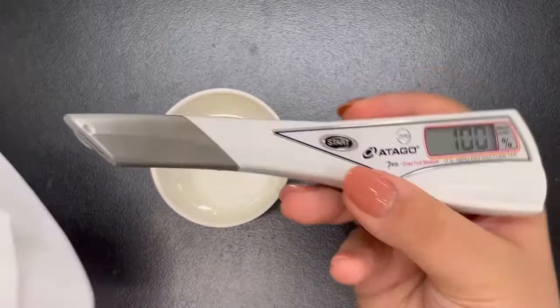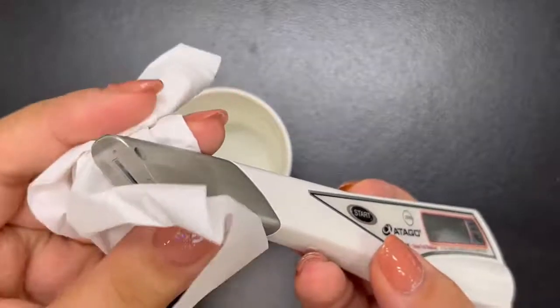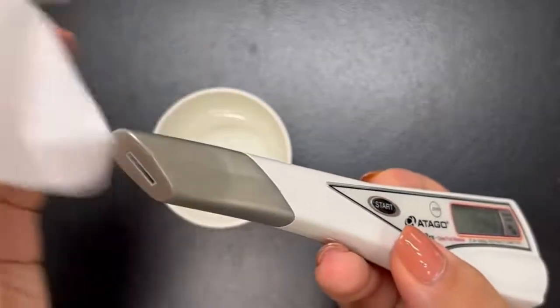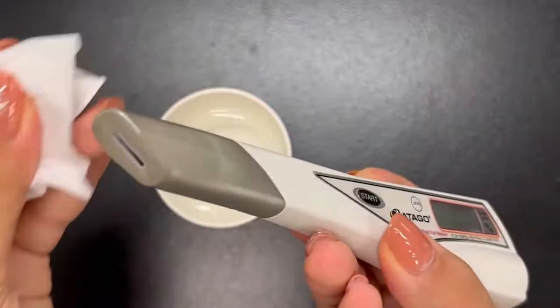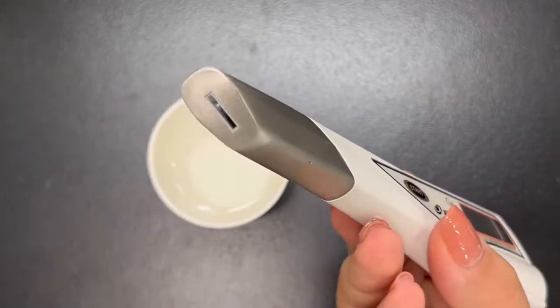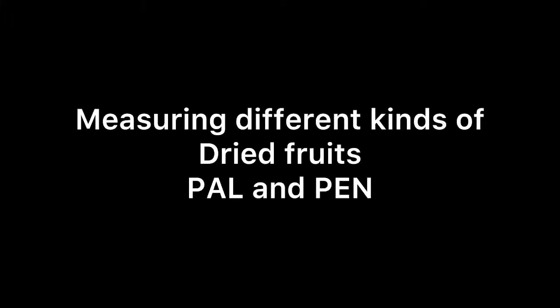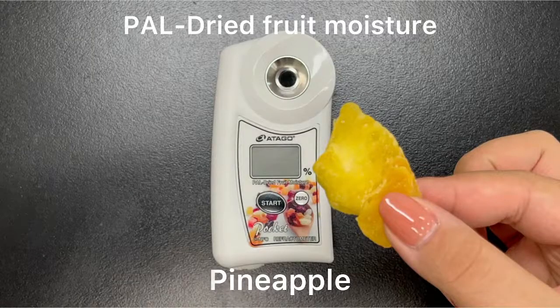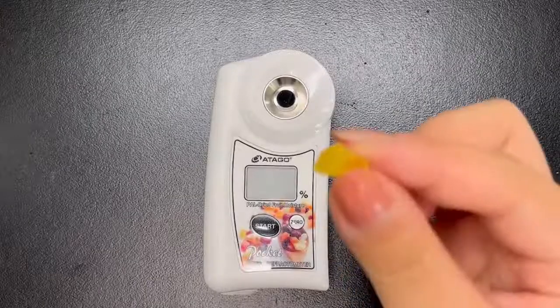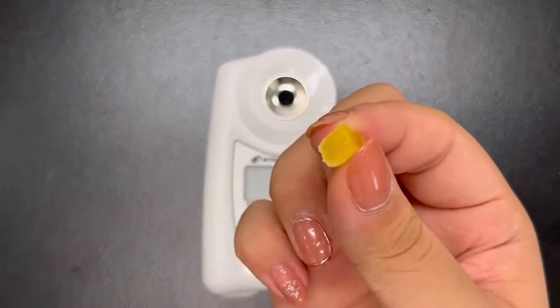When cleaning the sample stage, it is a bit different with the PAL. With the PEN, cleaning may be easier because all you have to do is wipe — but make sure there are no dried fruit pieces or water left. Now let's see the measurement of different kinds of dried fruits, starting with pineapple.